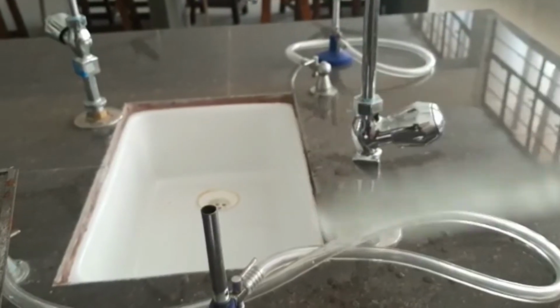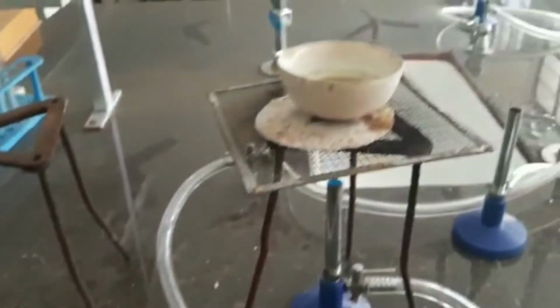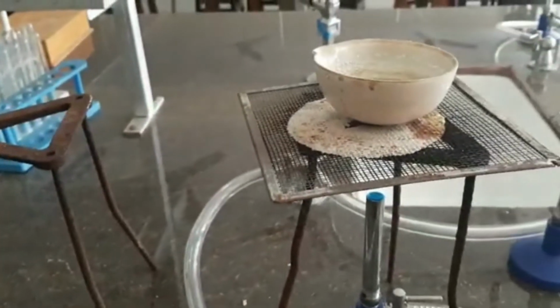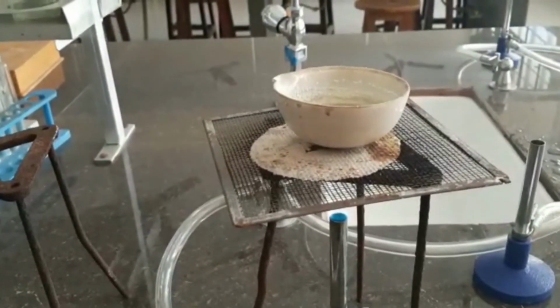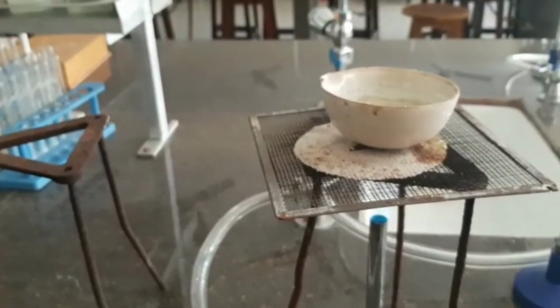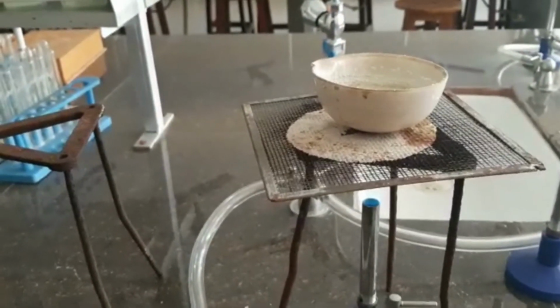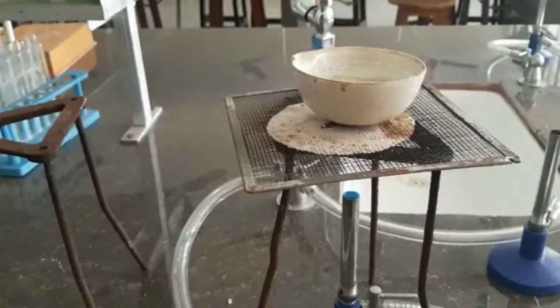So we are going to cool down. Allow the crystals to cool down slowly. So large size crystals, good crystals will be obtained, and it will take roughly 24 hours. You can even cool down by keeping it on a beaker of water if you want quick cooling, but slow cooling is going to give better sized, better colored crystals, and the crystals are monoclinic in nature, right? You've done this in solid state, so the crystals will be monoclinic. This is going to be helpful for both JEE as well as for your practical viva.